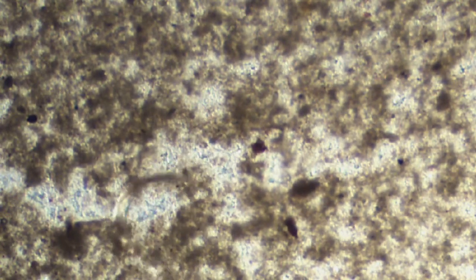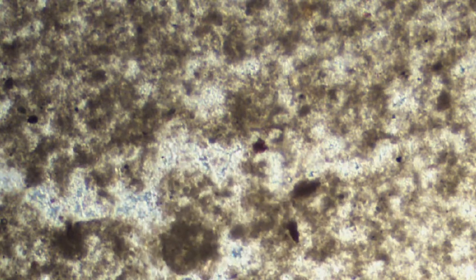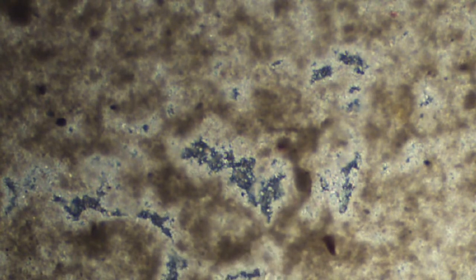There's a nematode in the muck. Well, it's a little less mucky than the last slide was, but it's really hard. There's so much mud suspended in this water sample. There's so much reflecting mud, I can't even get a proper dark field out of it, or only a little bit.